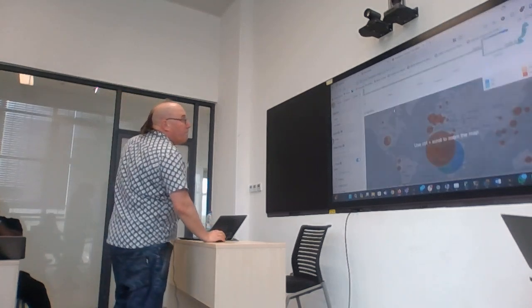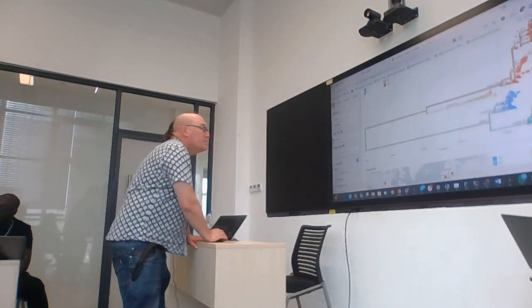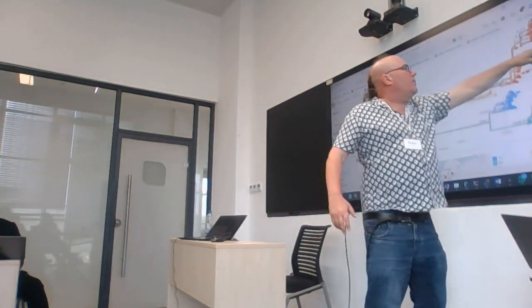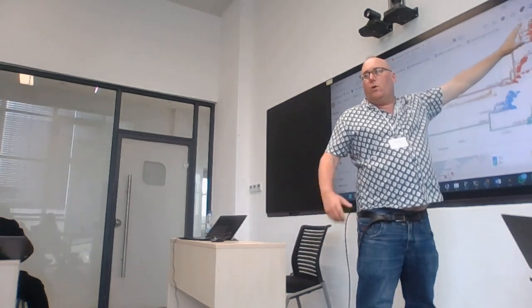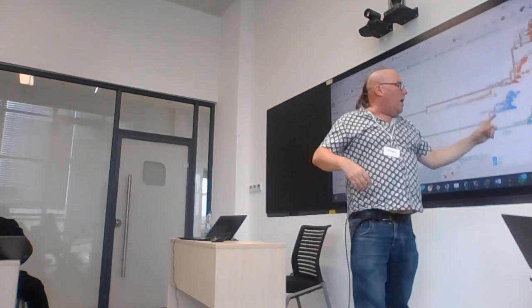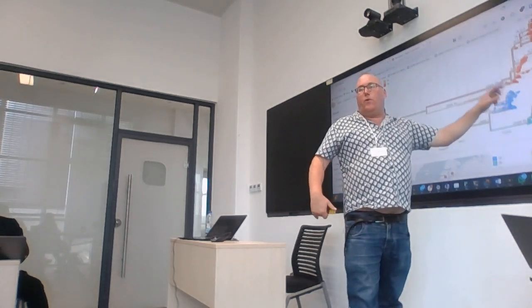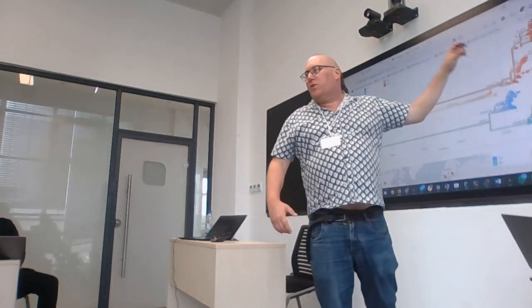But then you'll notice that here, there's B.1, there's A, there's all of these kind of things. In clade 2, all of these subclades have names. In clade 1, we've only named 1A and 1B, and we've not got names for the more detailed divisions.